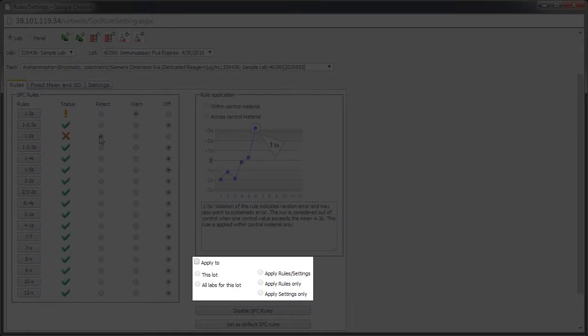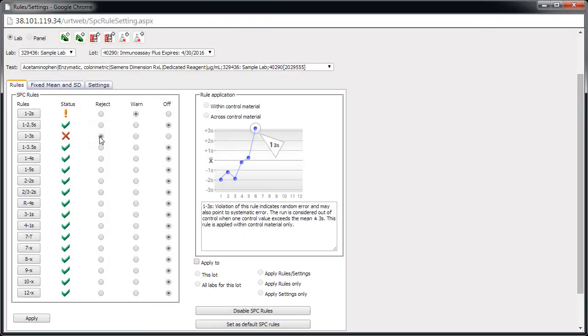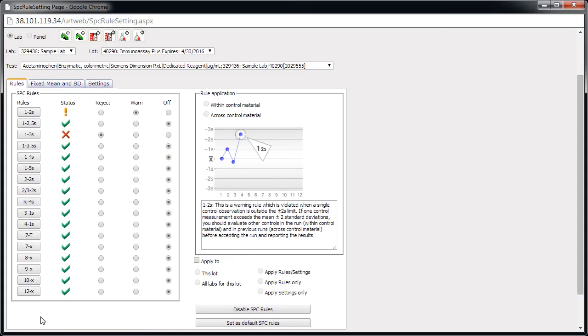To apply the rules to all tests within this lot, or all labs for this lot, select the checkbox and the appropriate option. Then click Apply. Remember, you can edit individual tests within the lot as necessary. Let's return to the page where we left off.